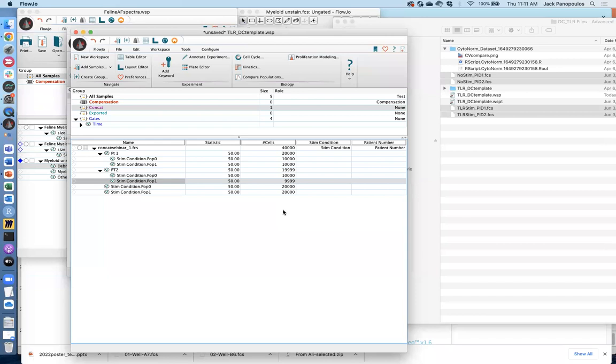Okay, but if you have only one, what do they say? It takes only one bad apple to spoil the barrel. So that's kind of true when it comes to the use of these tools and a single sample that is problematic. So I would try to chuck the low quality samples, or at least group the low quality samples together and maybe compare them to one another rather than mixing them with the high quality stuff.